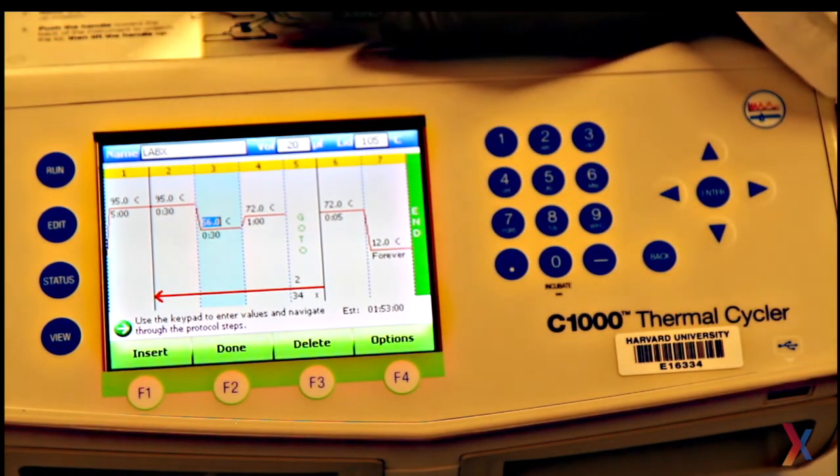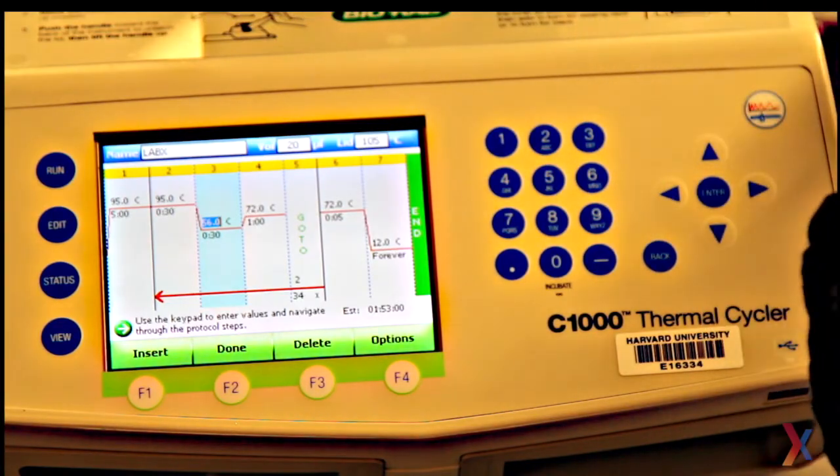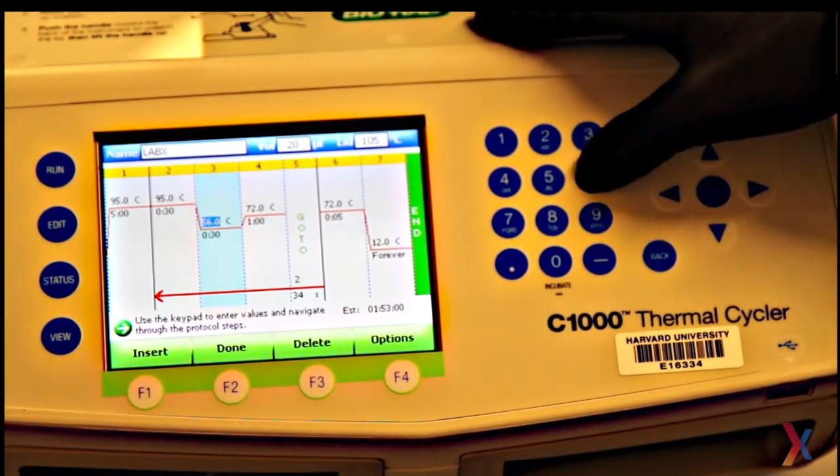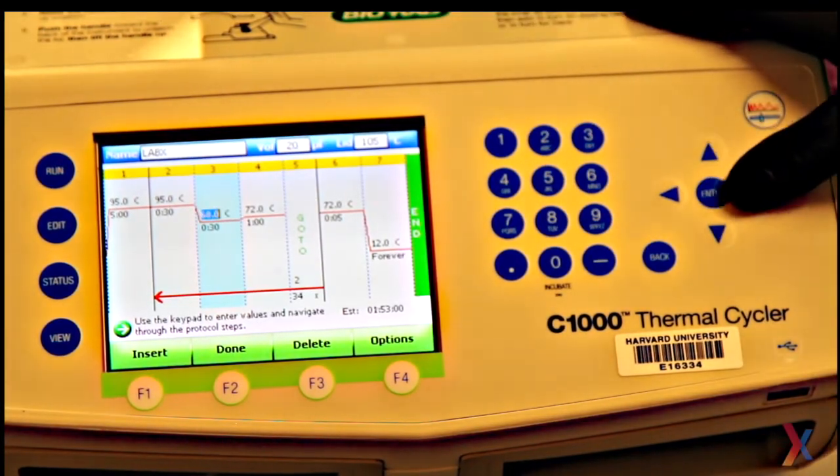Next is the annealing step. I'll calculate the temperature for this using the average of the TMs of each of my primers. So this will be at 68 Celsius for this primer pair, again for 30 seconds.